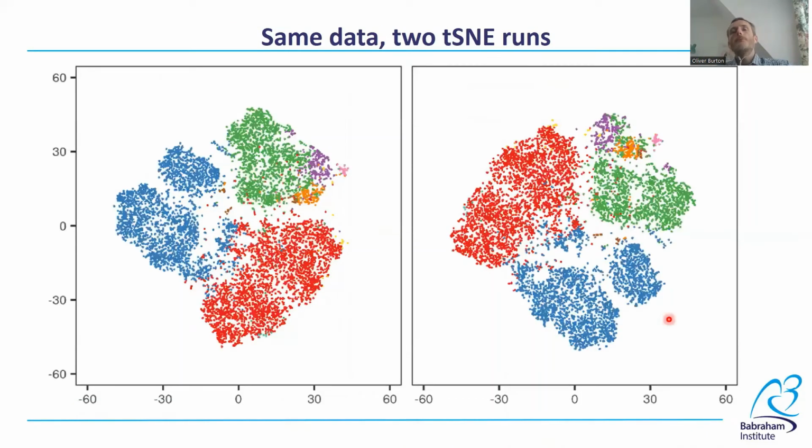What does this mean? Well, if we generate two t-SNE distributions of the same original data, they will look quite different due to random initialization. You can see that the colored clusters in these two examples, running off of different initializations, look about the same, but they're in different places. These are the same cells in both examples. They're rotated around and shuffled, so nothing's in the same place. Nothing has the same coordinates.